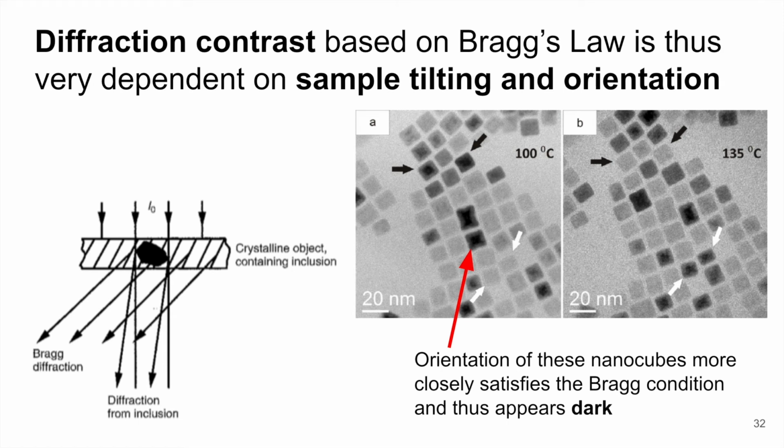All right, so diffraction contrast obviously relies on Bragg's law, and so we have the incident beam is like our X-ray beam from XRD, and we know angle is very important there, right? Because we have to have the alignment such that we are in a certain Bragg angle such that we have diffraction. In other orientations, we tend to not have that constructive interference and therefore diffraction. So the angle of things, the orientation is very important.